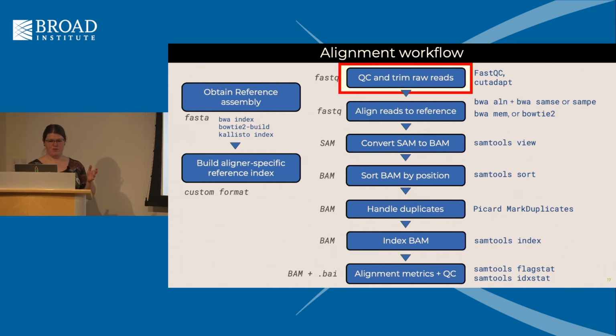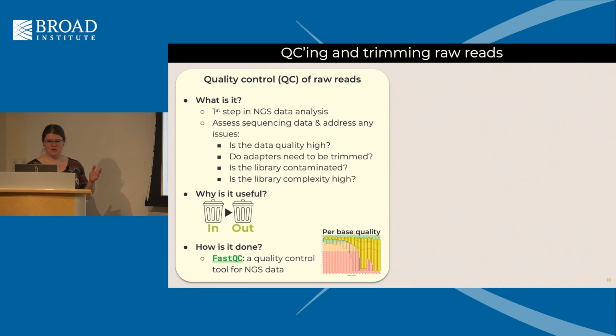Okay, so moving into the alignment workflow proper. For QCing and trimming raw reads, this is important, especially if it's the first time you've done a particular kind of experiment.